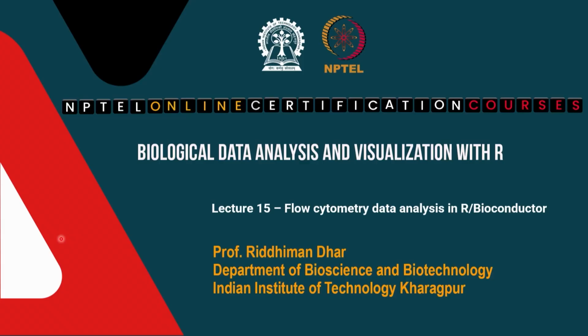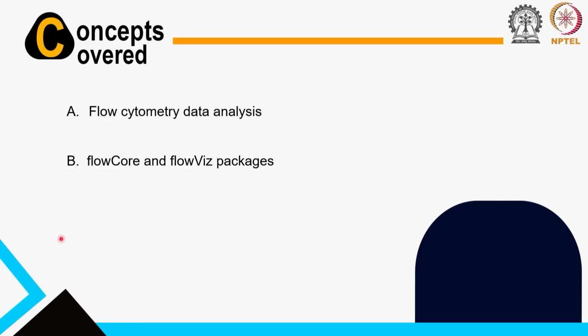In this class we will introduce another package which is actually very useful if you are working with flow cytometry data. So, the topic of this class would be flow cytometry data analysis in R with Bioconductor. This is a Bioconductor package that allows us to process flow cytometry data. Okay, so, this is the agenda for this class.